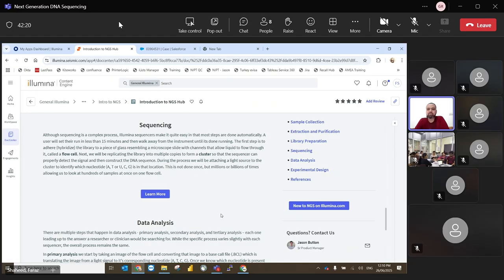Like A will give a wavelength of some particular value, T will give a different value, then C and then G. And if it's RNA, then we'll talk about U as well. But in general, Illumina used to use 4 fluorescent dyes to differentiate 4 bases.